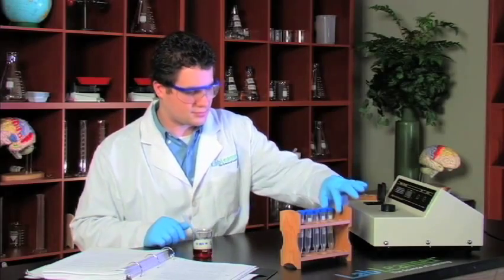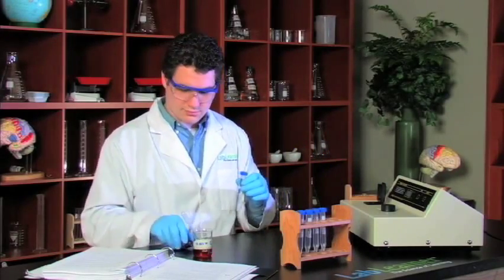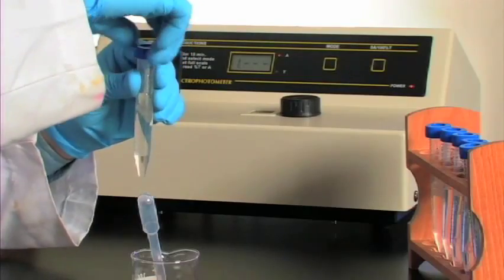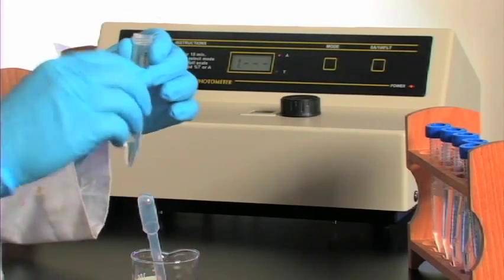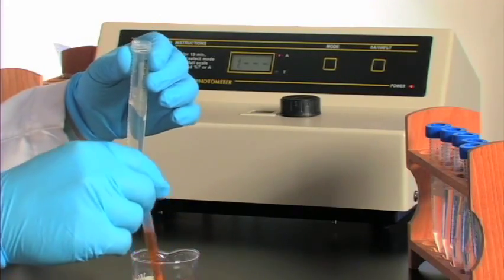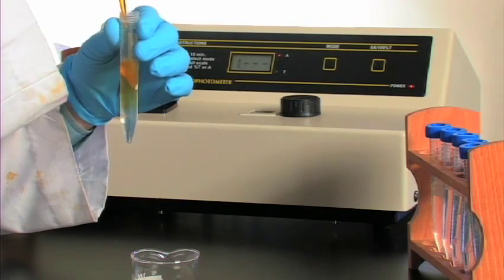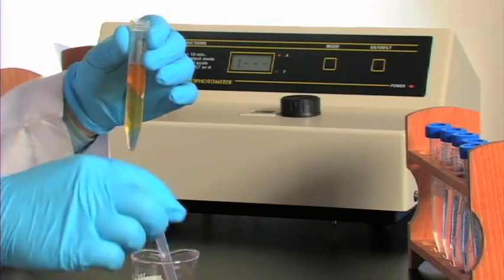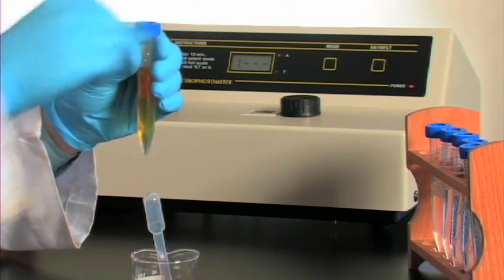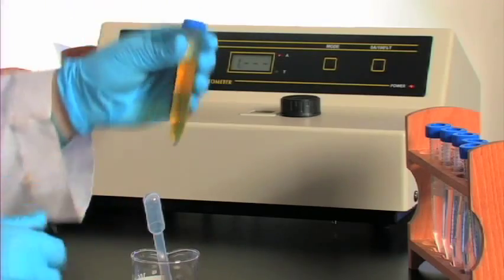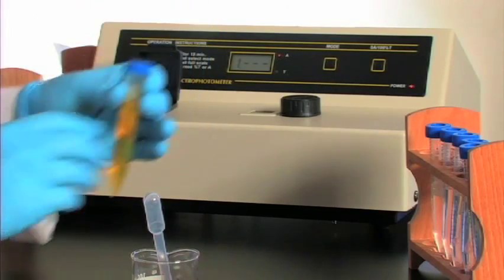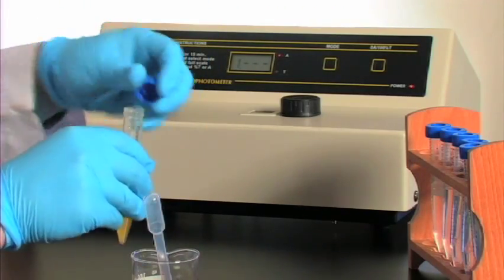Now to initiate the reaction in the first tube, Phil's going to add two milliliters of this iodine solution up to the ten milliliter mark, quickly replace the cap and invert the reaction several times. And as soon as he begins inversion he begins timing the reaction.